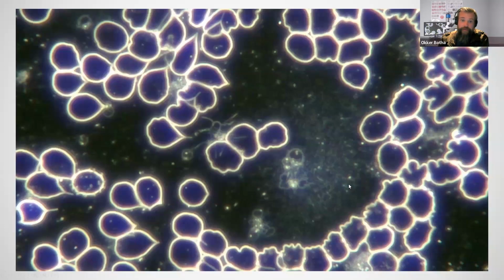So here we can see quite a few of these small little white dots. Those aren't imperfections in the glass. Those are structures in the blood, and in a live sample they move around quite actively. So it's important to be able to see them, because if you're not, you also won't be able to see the other structures. So here we have some really interesting things happening in the blood, and these fine lines towards the center of the image are also usually active, and they're moving around.